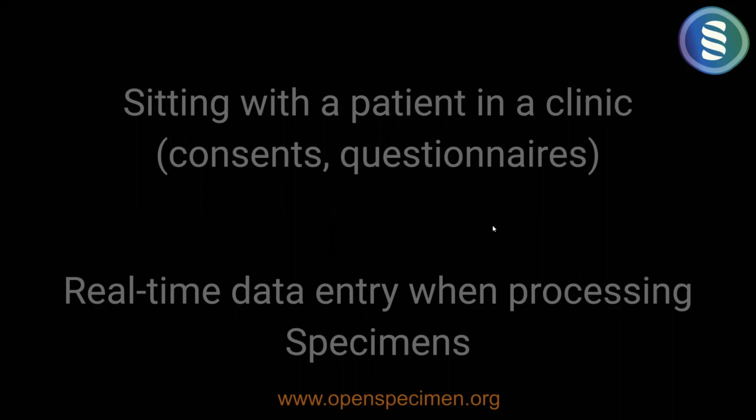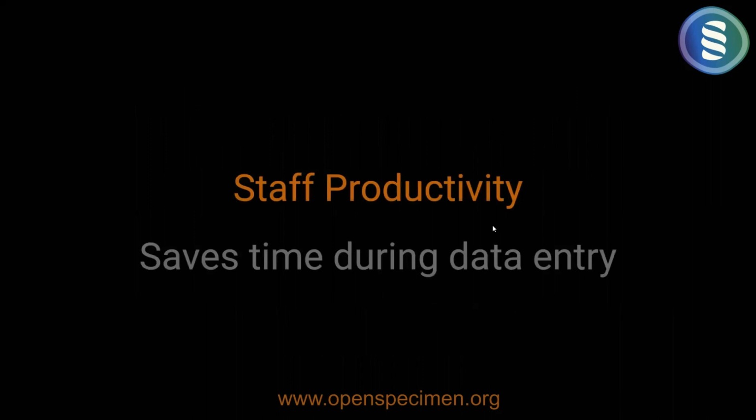So some of these things are better done on a tablet. And the ultimate goal is to save time for end users. The easier it is to do, the less time it takes, and therefore you improve staff productivity and save time and money that is better spent on other things.